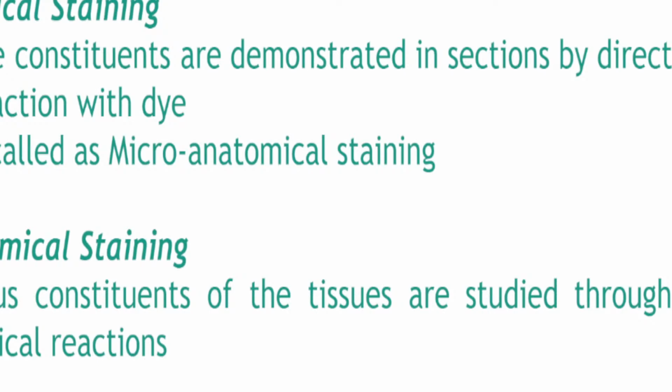So we have three types of stains, of course: histological stains, histochemical stains, and immunohistochemical stains. So what's the difference between the three? Okay, histological stains are also known as your microanatomical stains, and they are used to demonstrate the interaction of tissue constituents with the dye. Okay, whether it will intake the stain or impart the stain. There's also terminologies like eosinophilic or basophilic, right? Usually, which is eosinophilic, the nucleus or the cytoplasm?